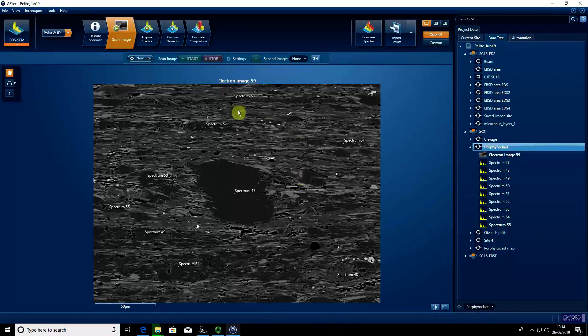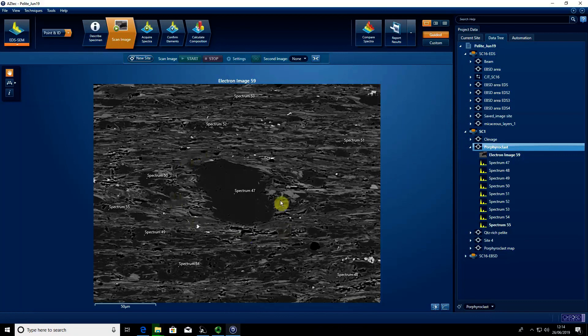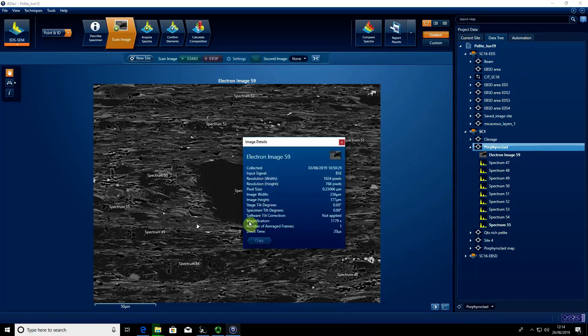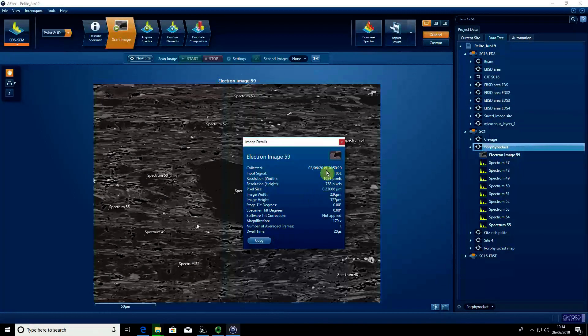You can see here we have our backscatter image with spectral locations. To find out what resolution the image is at, we right-click, go to details, and we can see it's 1024 pixels by 768 pixels.